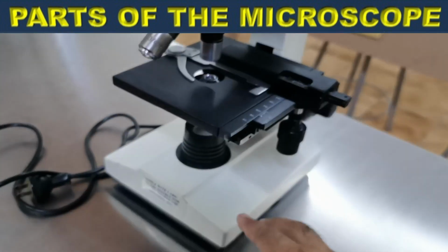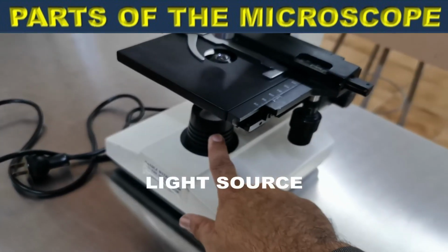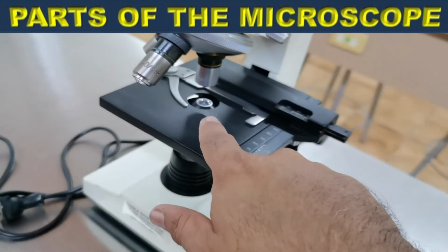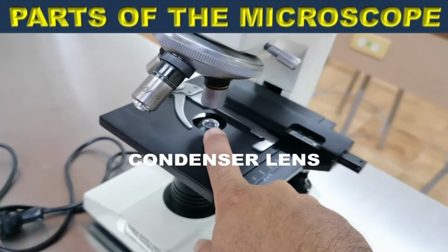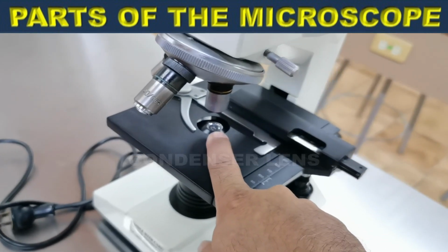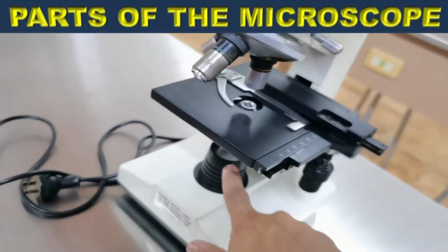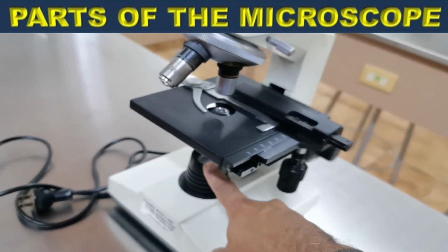Then we have here the illuminating part. So we have here the light bulb that gives you the lighting. And we have here the condenser lens that focuses the incoming light onto the specimen. So that's the condenser lens, and this is the light source, or the light bulb that illuminates the specimen.